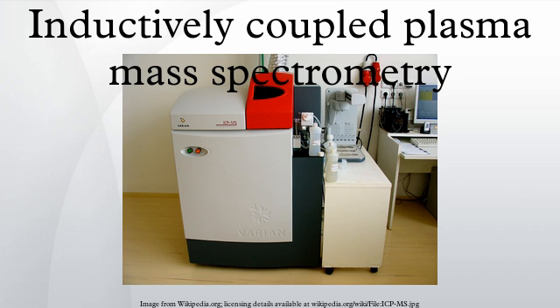The process continues until the rate of release of new electrons in collisions is balanced by the rate of recombination of electrons with argon ions. This produces a fireball that consists mostly of argon atoms with a rather small fraction of free electrons and argon ions. The temperature of the plasma is very high, of the order of 10,000 K. The ICP can be retained in the quartz torch because the flow of gas between the 2 outermost tubes keeps the plasma away from the walls of the torch.